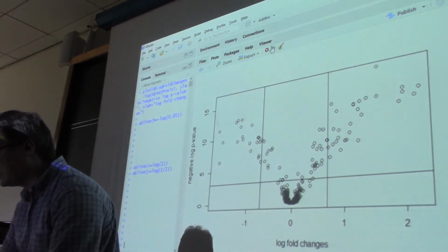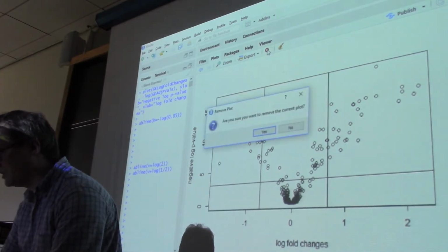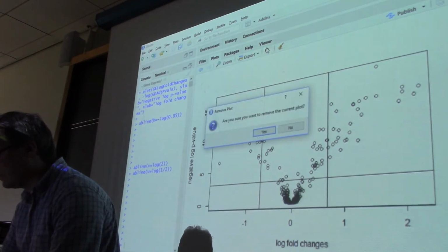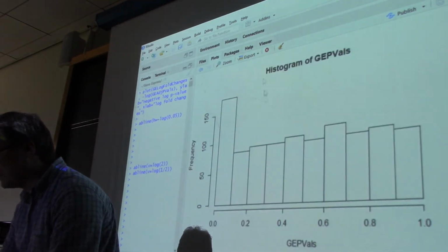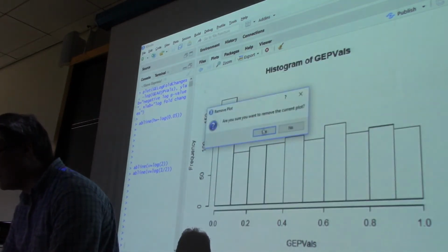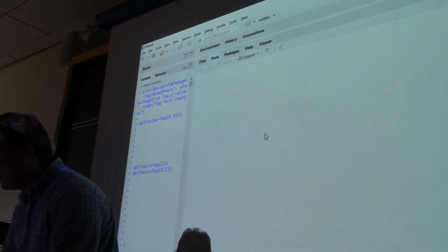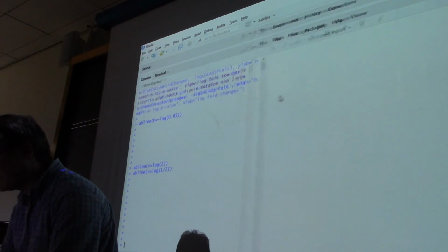I'm going to put this image away for just a moment because it's otherwise going to fuss at me. I'm going to take that one away as well. How many of these do I need to nuke before I get back to nothing? I made a lot of plots today. Okay, let's drag this back over.